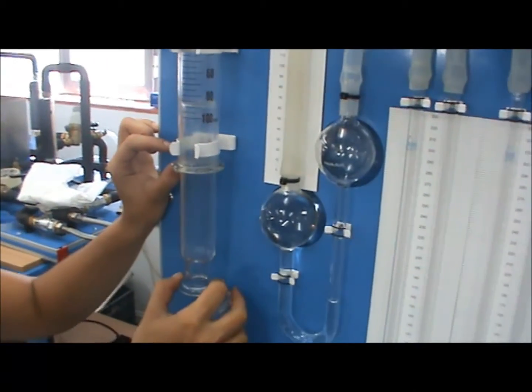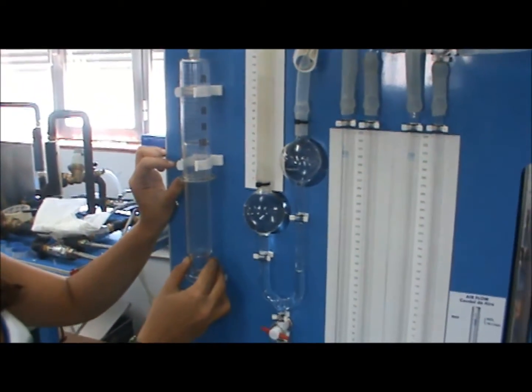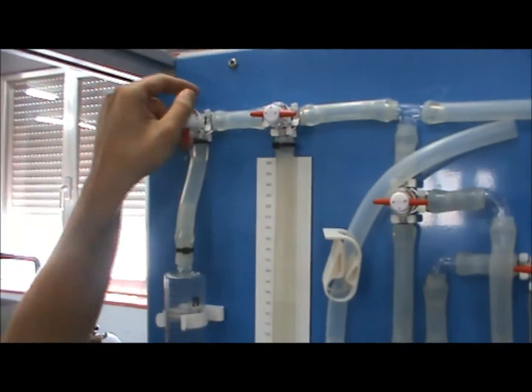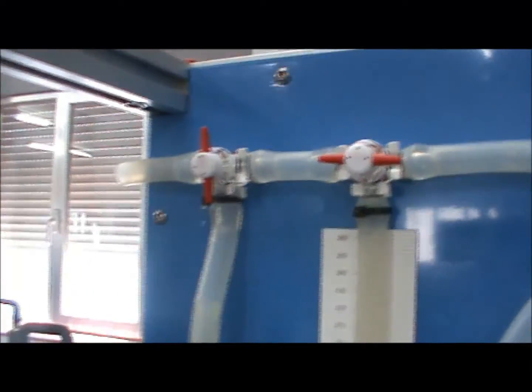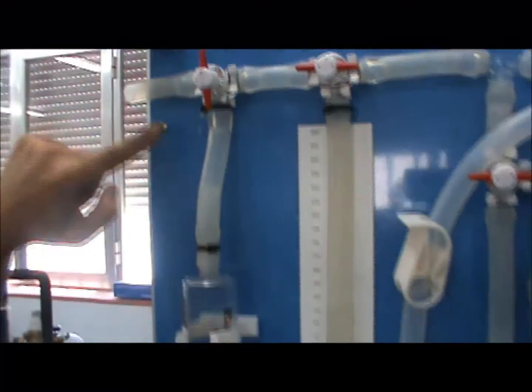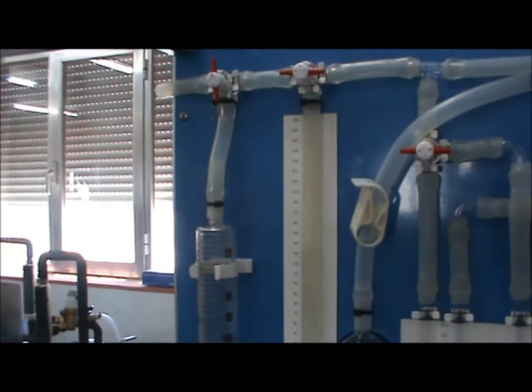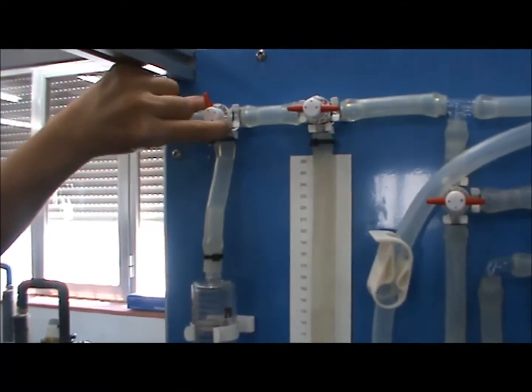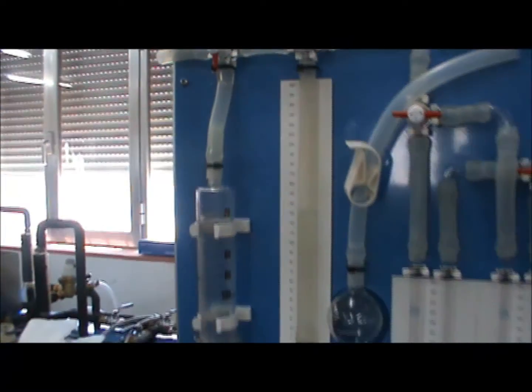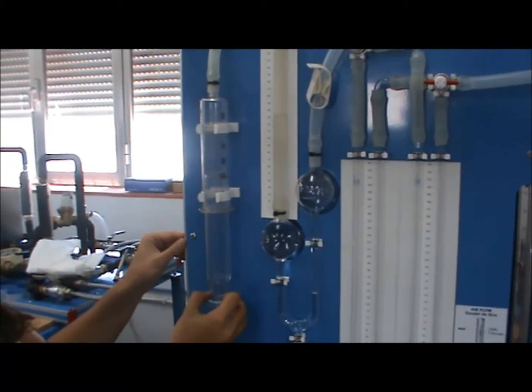Now, push the plunger down, drawing the air mixture from the column into the syringe. Turn valve VT3 to expel the sample to the atmosphere. Repeat these steps five to six times to clear the lines, and to ensure that the sample is representative of the mixture in the column.